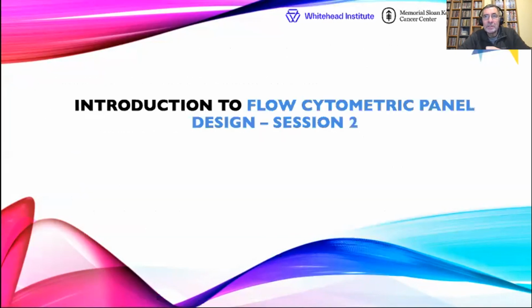So what we're going to be doing today, as I said, is following on a little bit from what we did at our last session, where we started to look at panel design, generally in terms of multicolor fluorescence. But today we're going to concentrate more on maybe when things can go wrong, and also looking at sample preparation as well.